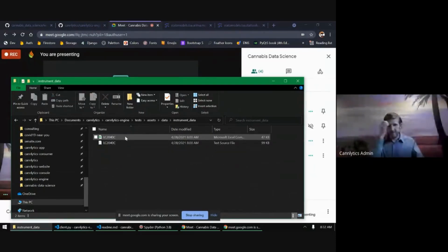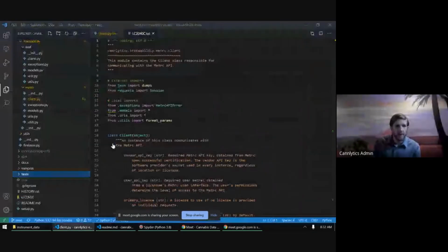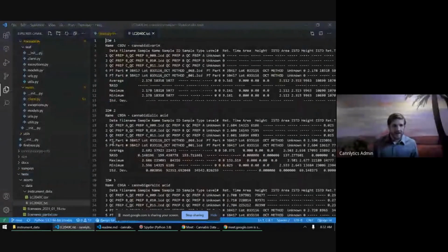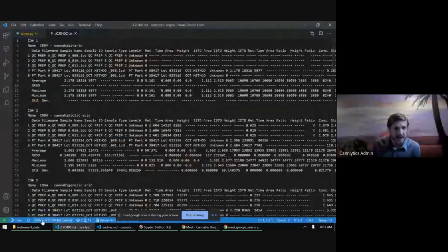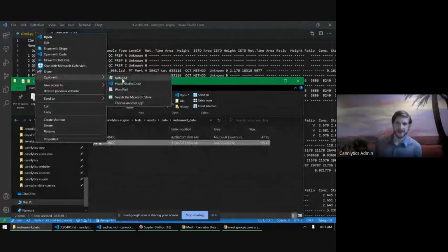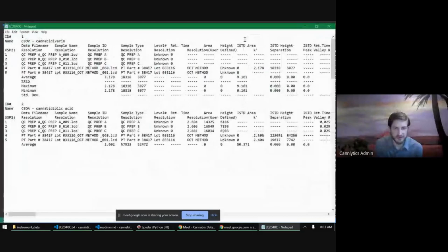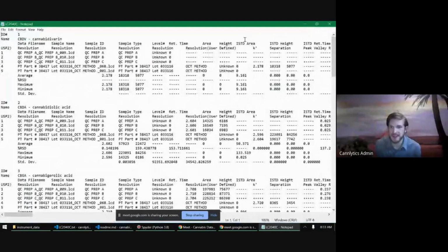Exactly. So, Nick, essentially at the laboratories, when the data comes off the instrument, it just looks like this. This is what the scientific instrument is spitting out whenever you send in the test result.